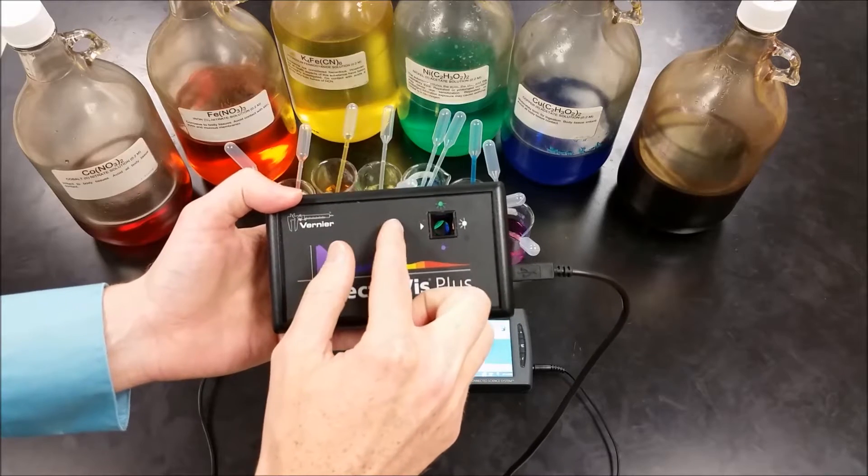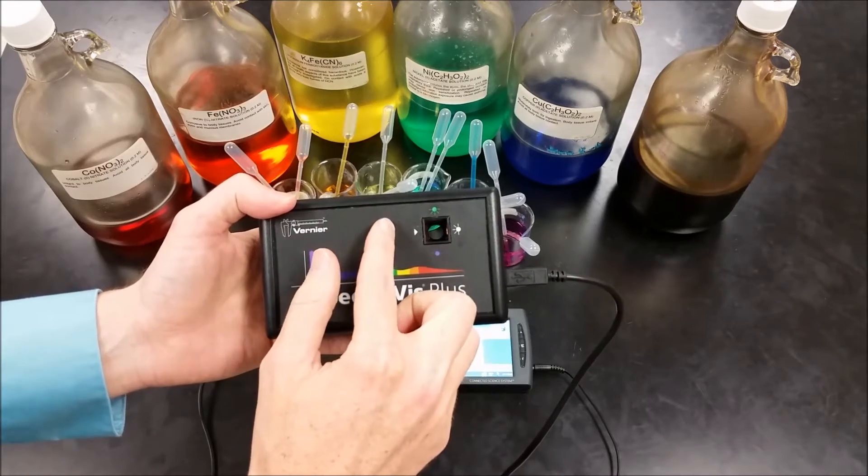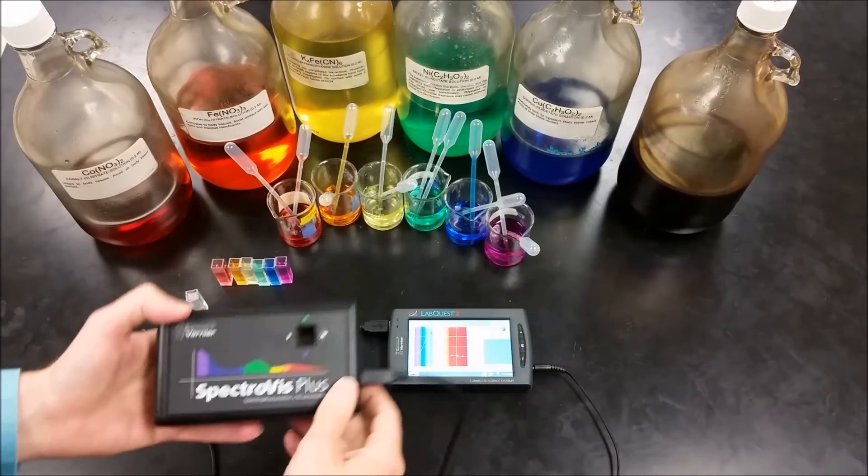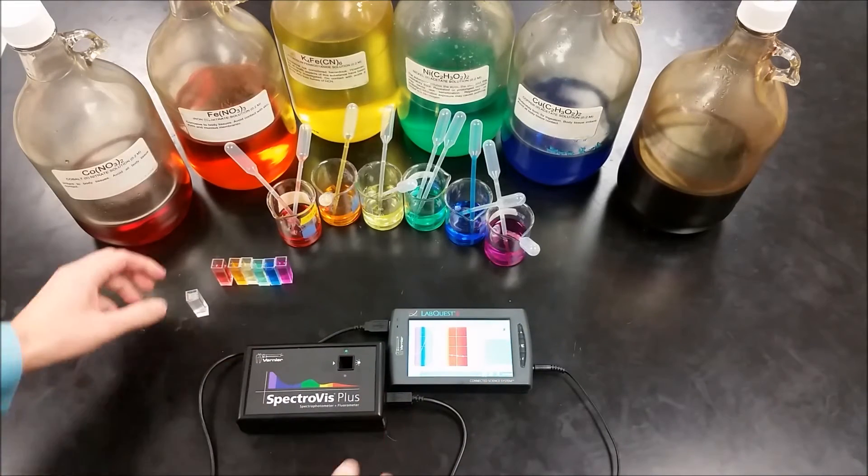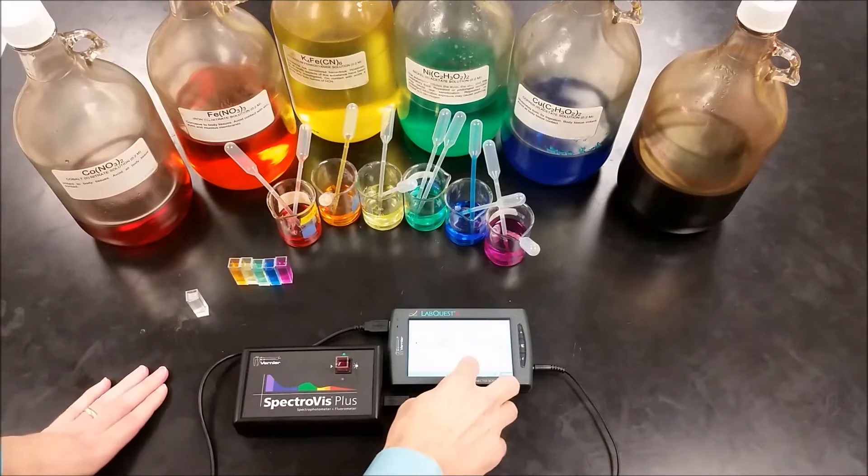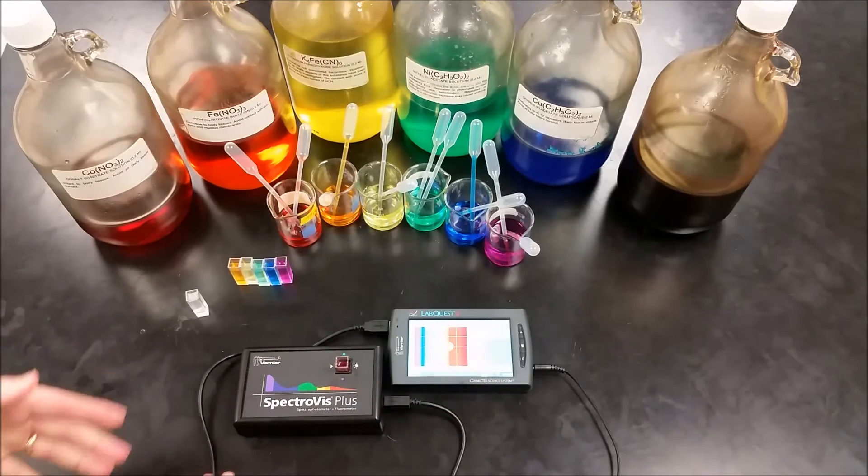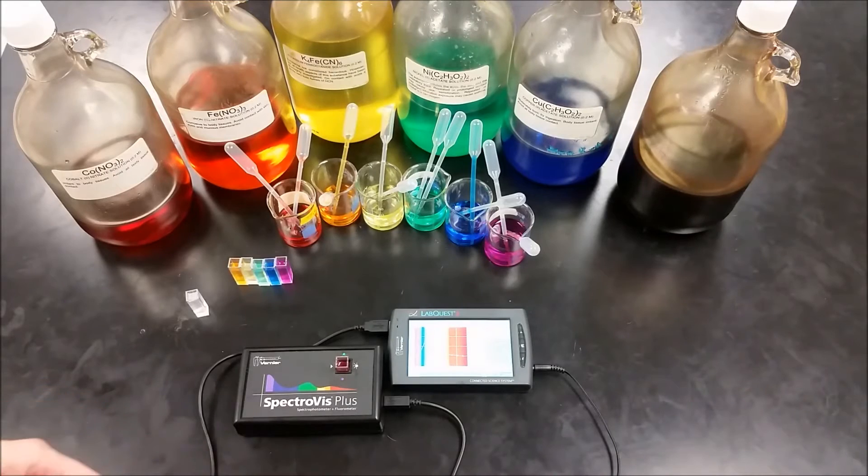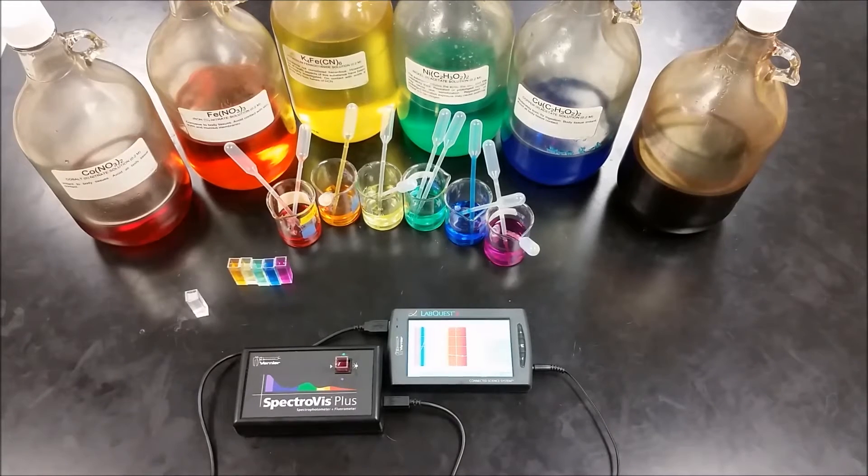and then gets detected over here so we can see what colors of light are being absorbed and which ones are transmitting through the solution. If we go ahead and take a red solution here and hit play, this is going to show us which colors are being absorbed and which ones are being transmitted.